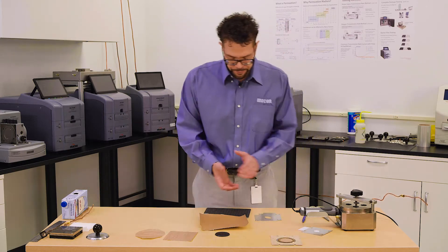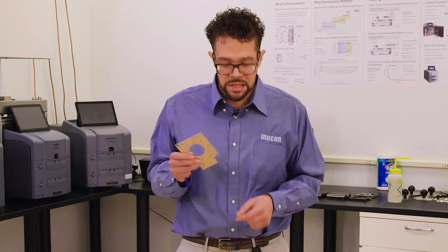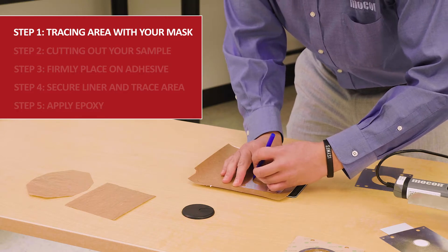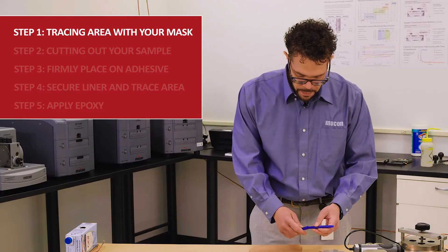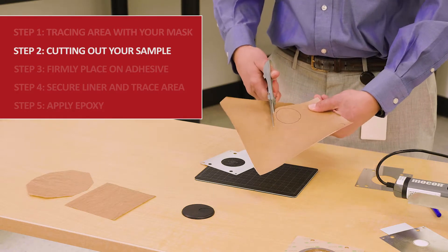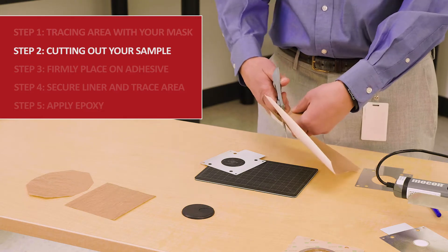Now I'll go through a quick prep so everyone can see how we actually do this — there are a series of steps. I have a mask here; on the back it has adhesive. I lay this mask down on the paper board, take a pen, and trace out the test area. Next, I cut this test area out slightly larger than the traced area. That allows some area for the sample to adhere to the mask while still maintaining the test area that I want.